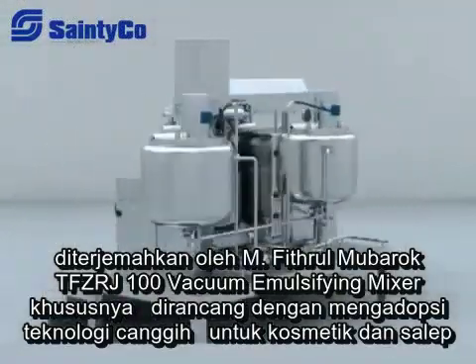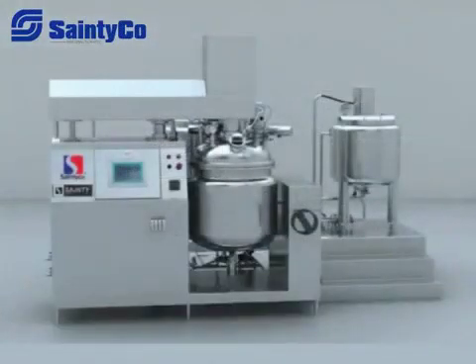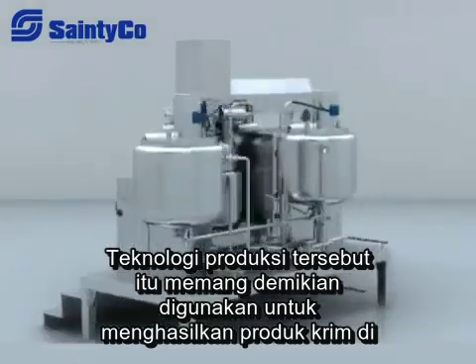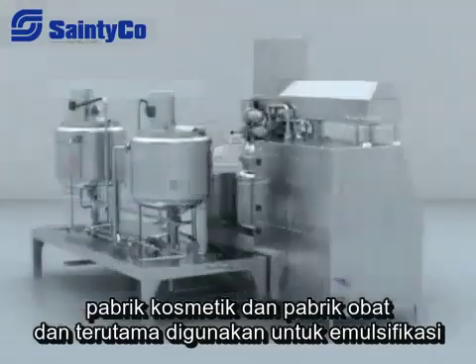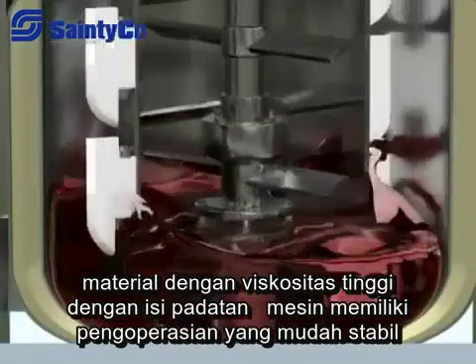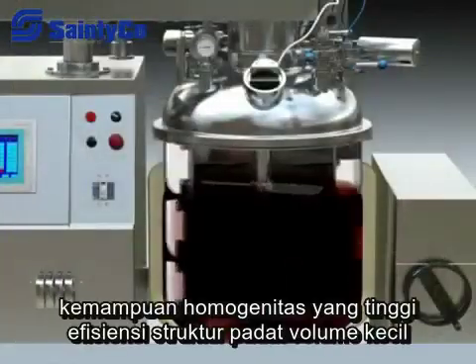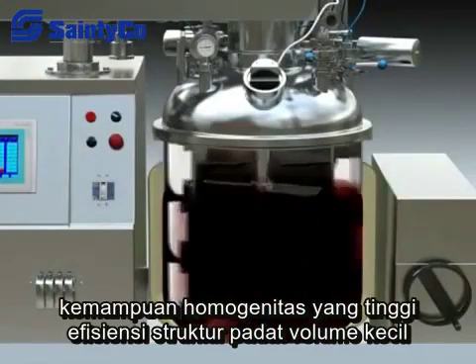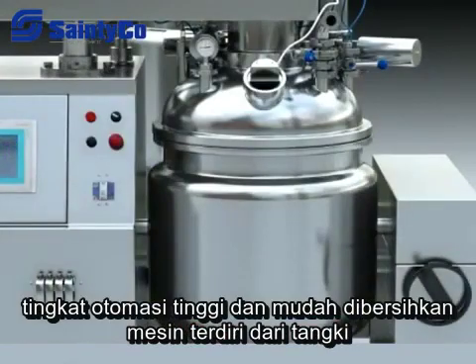The TFZR Vacuum Emulsifier is specially designed to adopt advanced technology from overseas according to cosmetic and ointment production technology. It is used to produce cream products in cosmetic and medicine factories, and is specially used for emulsification of peptic material with high content of solids. The machine features easy operation, steady capability, good homogeneity, high efficiency, solid structure, small volume, high automation level, and is easily cleaned.